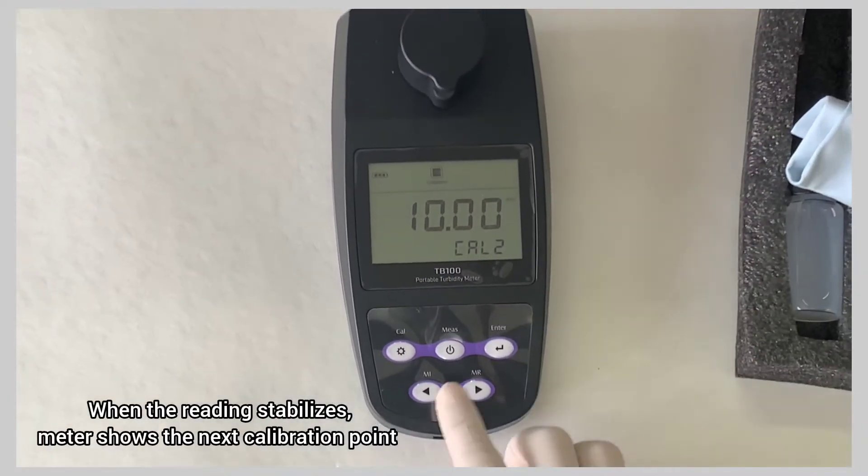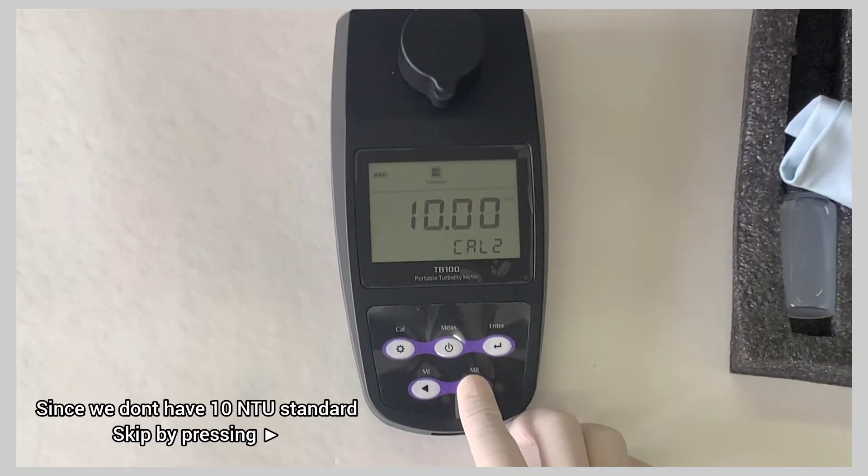When the reading stabilizes, the meter shows the next calibration point. Since we don't have 10 NTU standard, skip by pressing the given arrow.